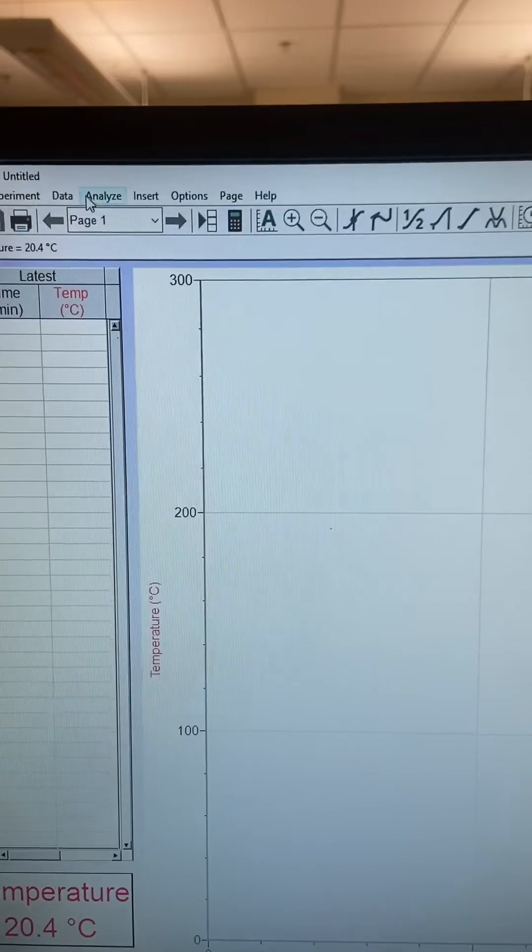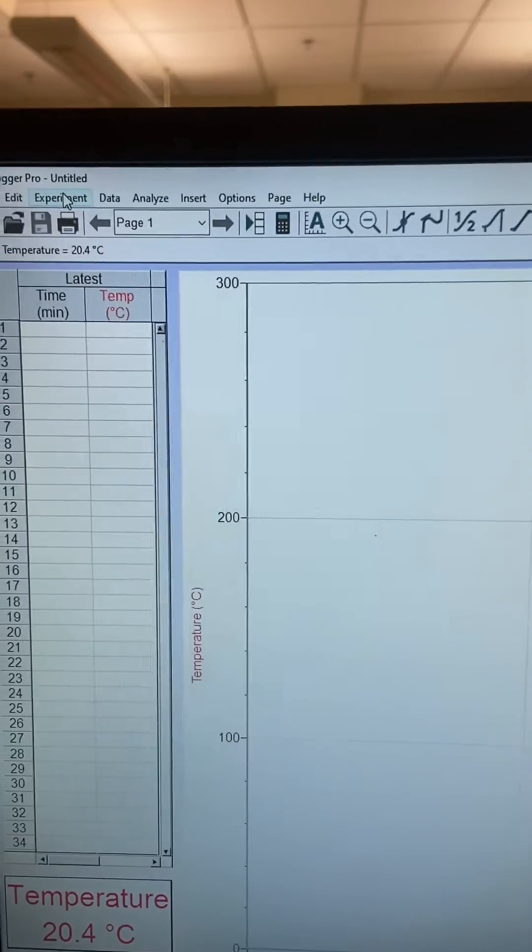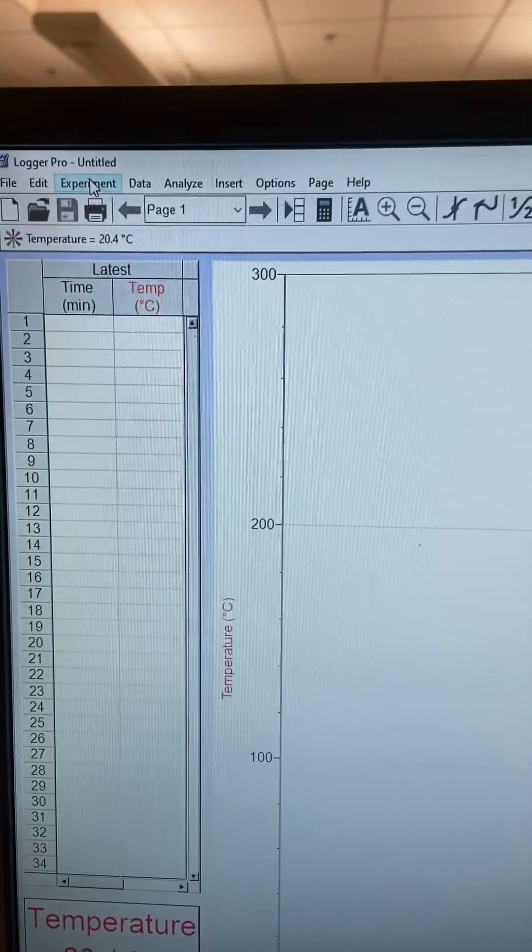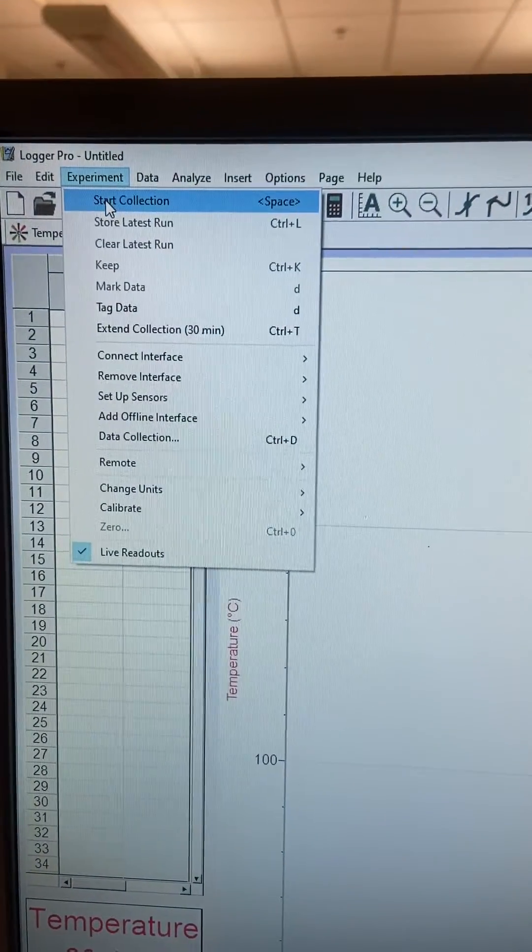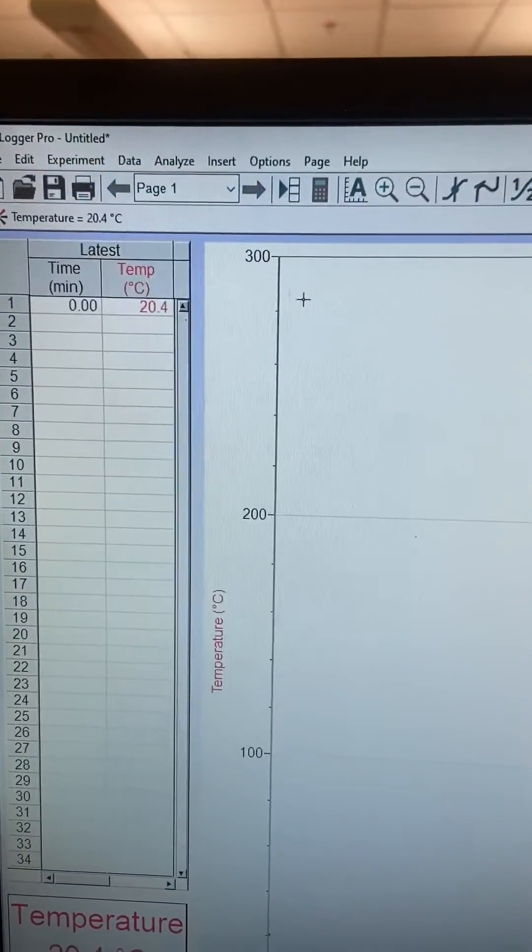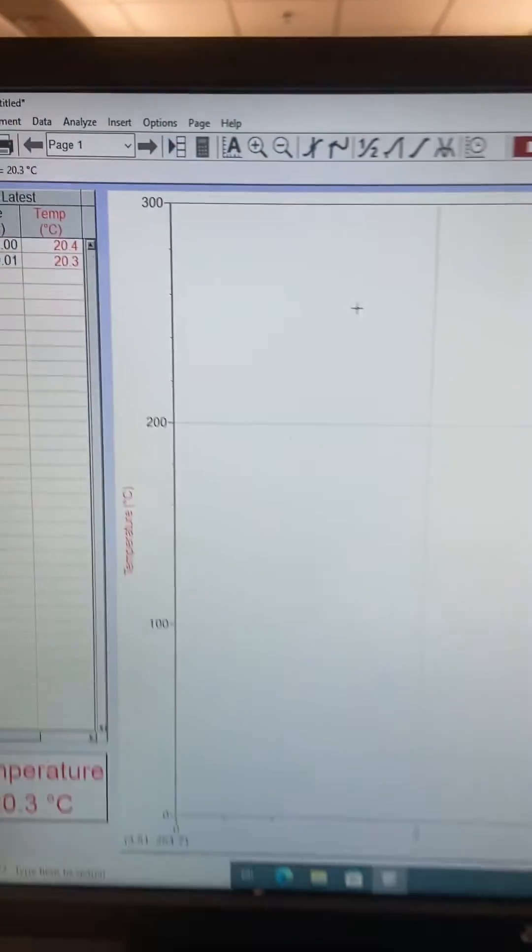I open this, and then if you click Experiment, we can start to collect data.